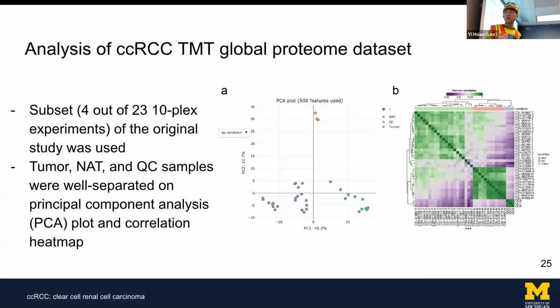And then in FragPipe-Analyst, we will be able to see some of the analysis popping up. One example is the PCA plot. The PCA, or principal component analysis, is usually used to investigate if you have a batch effect or an expected separation in your protein quantification result.